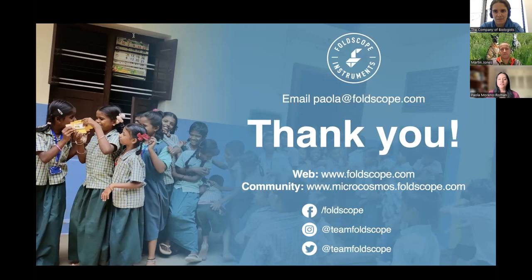In this case, using Foldscope, we can talk about differences within makeup that is cheaper or more expensive, fake products. It's about being creative in how you can link that. And as I said, Foldscope is a tool. It's a microscope, an amazing tool. It's more about the projects that you can design with it. So that would be my suggestion.